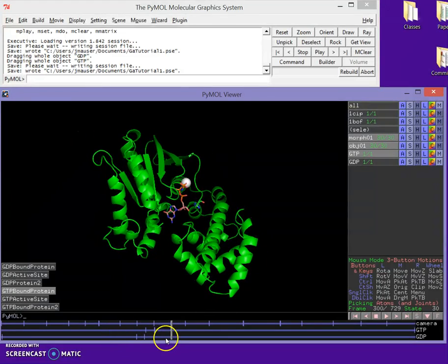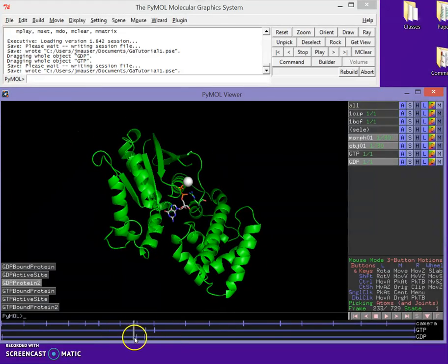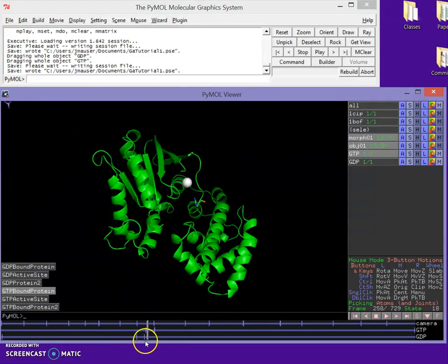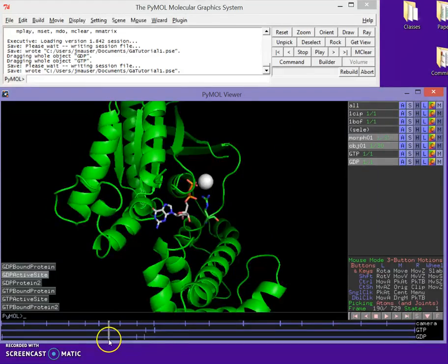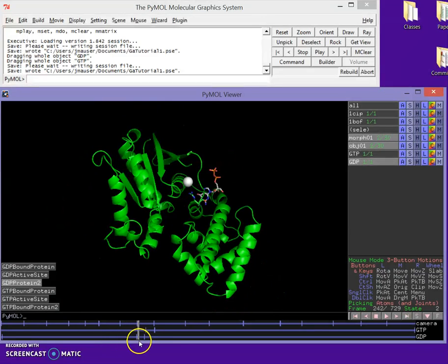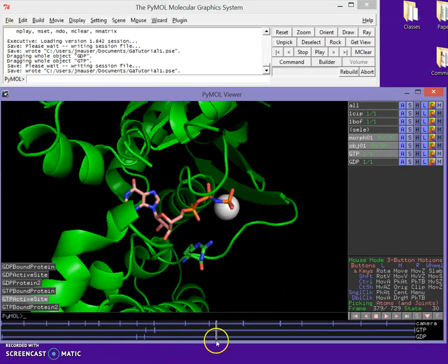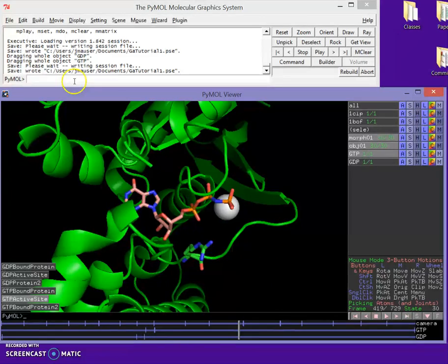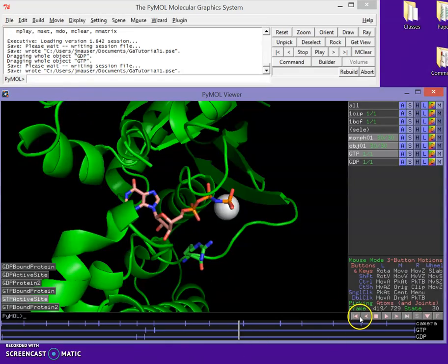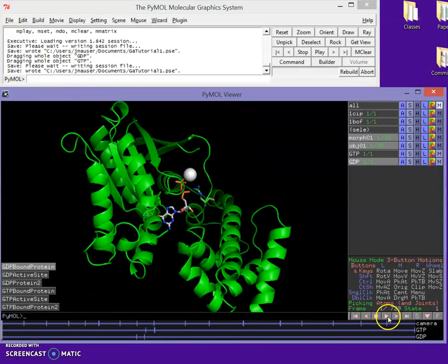Everything is animated and moving. We've got our two things flying in and out. Here comes our GDP, and our GDP flies in. And it's going to hold there until the end of the movie. So our movie's done. I like what I see. Let's make sure.